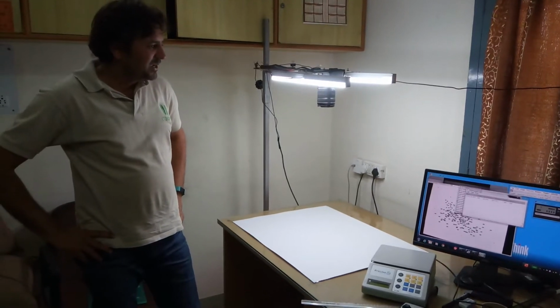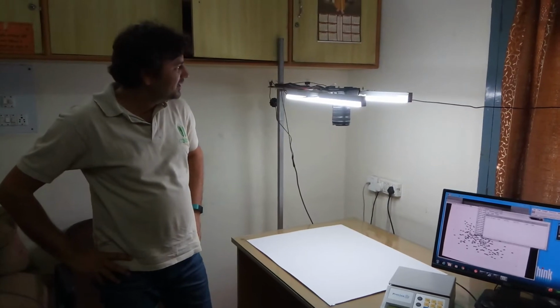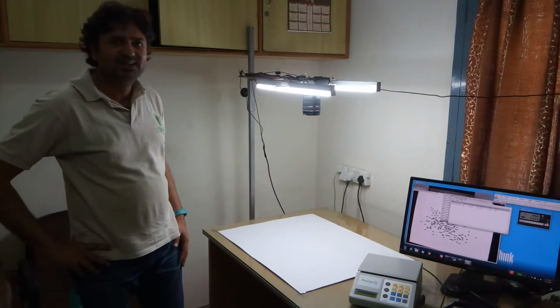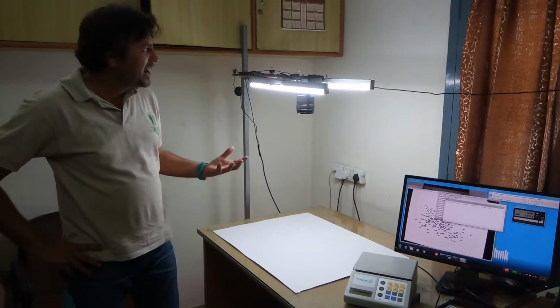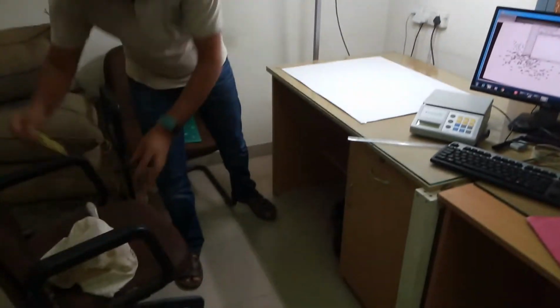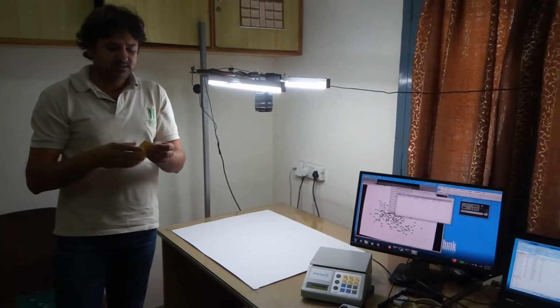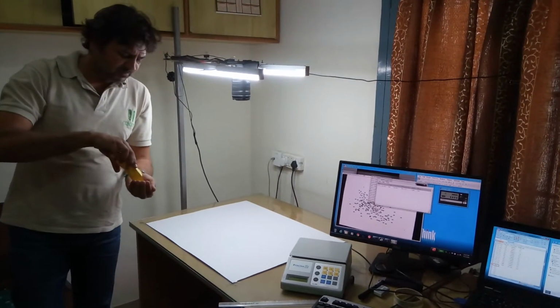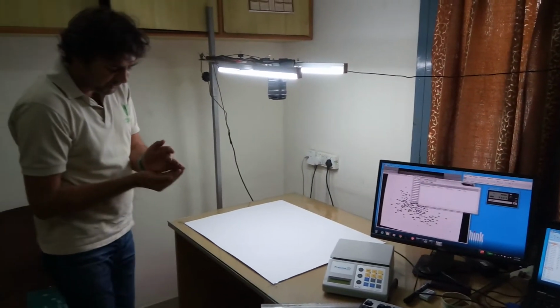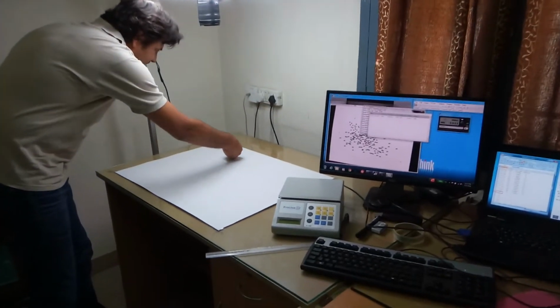Okay, so today we will demonstrate how we are counting seed very quickly using open source software and a few little stand or intervention or a frame to take the picture. So here I just take the envelope from the back, open it, and then spread the seed on the sheet.